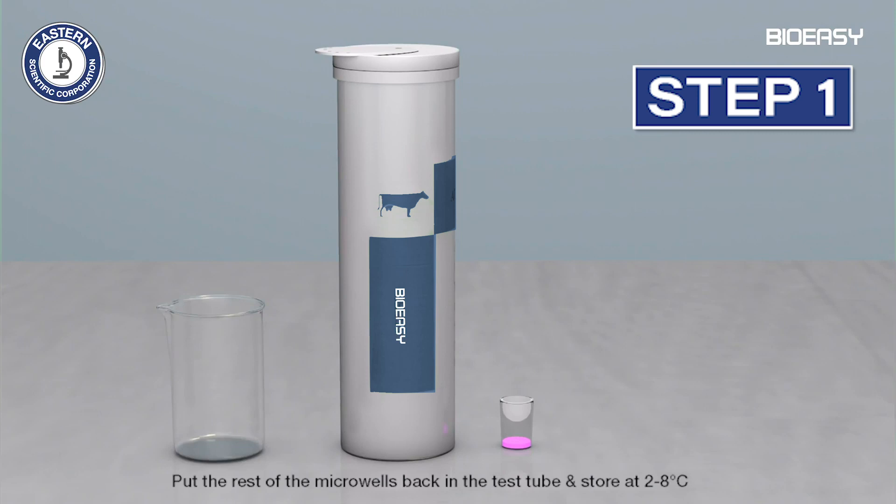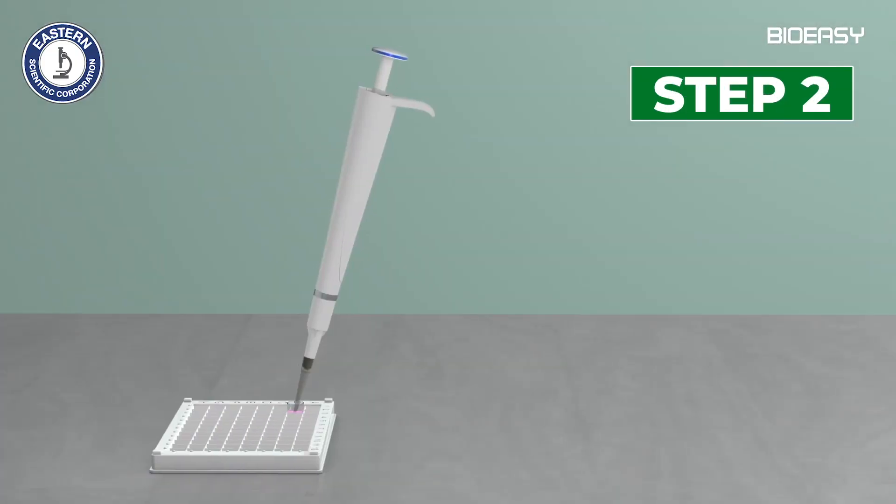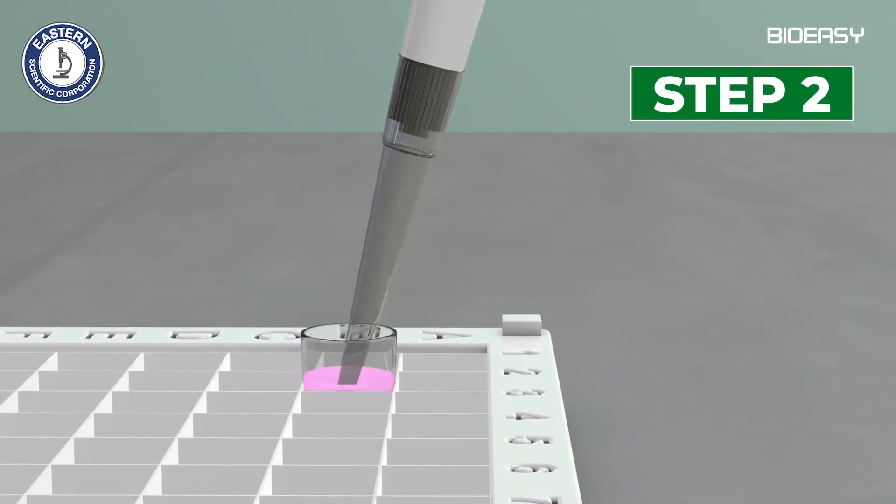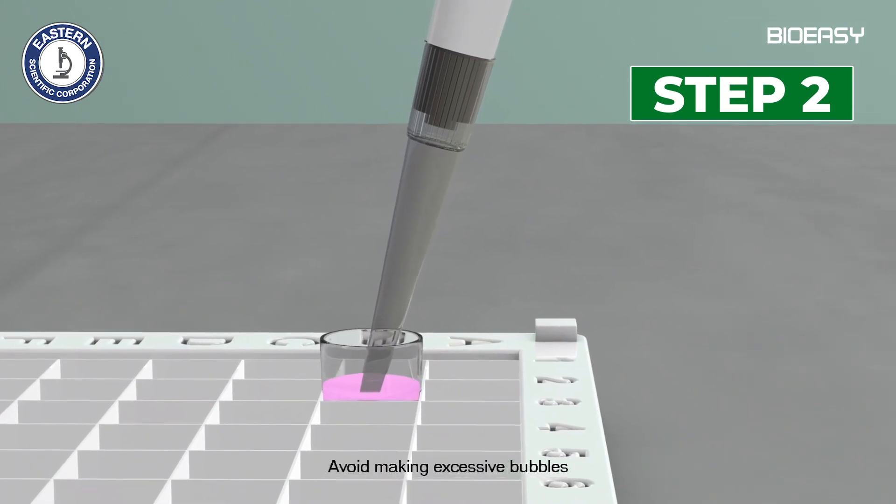Step 1: Take the required number of microwells and dipsticks from the test tube. Step 2: Pipette 200 microliters of milk sample into the reagent microwell and mix well by pipetting up and down 5 to 10 times.